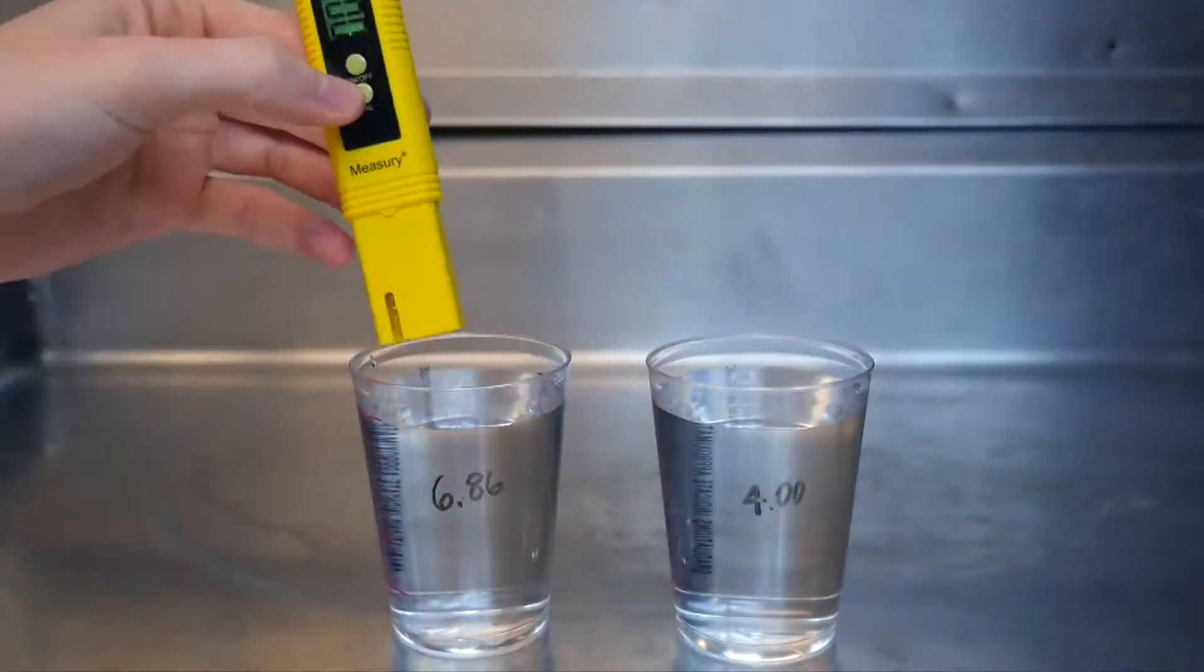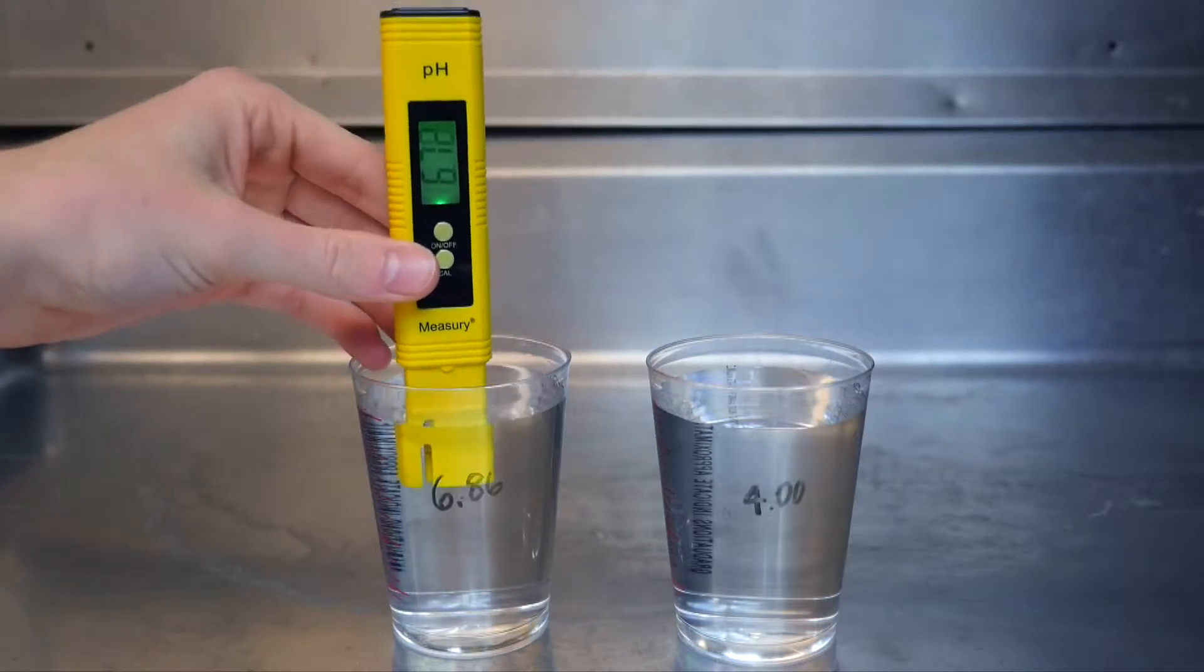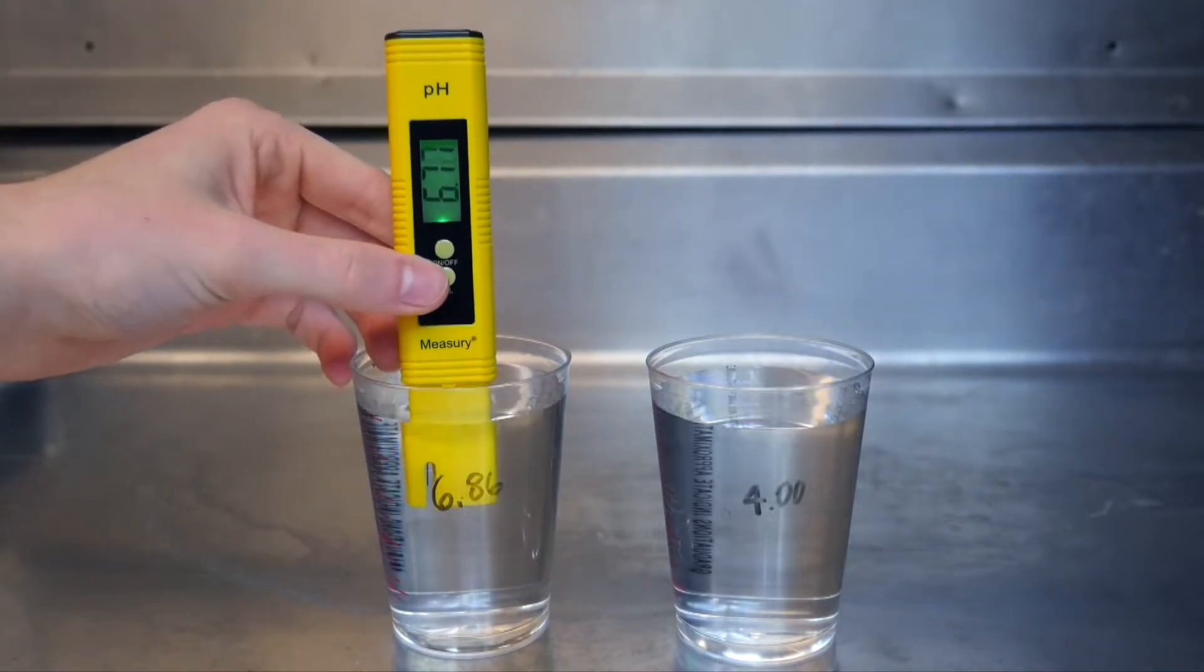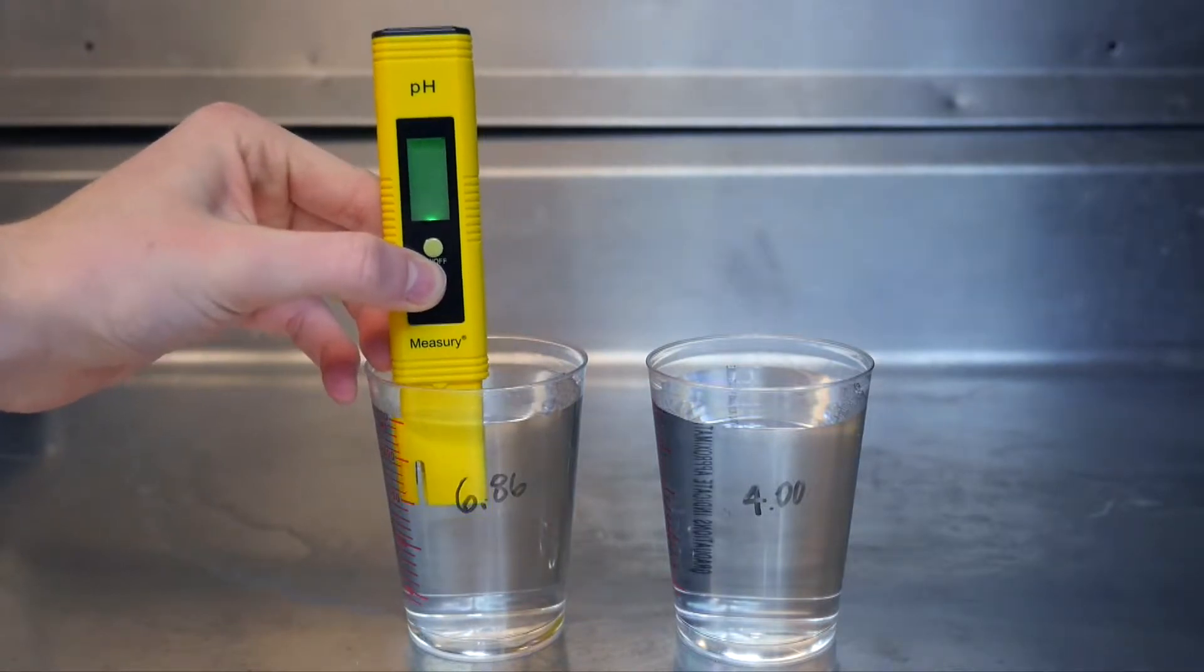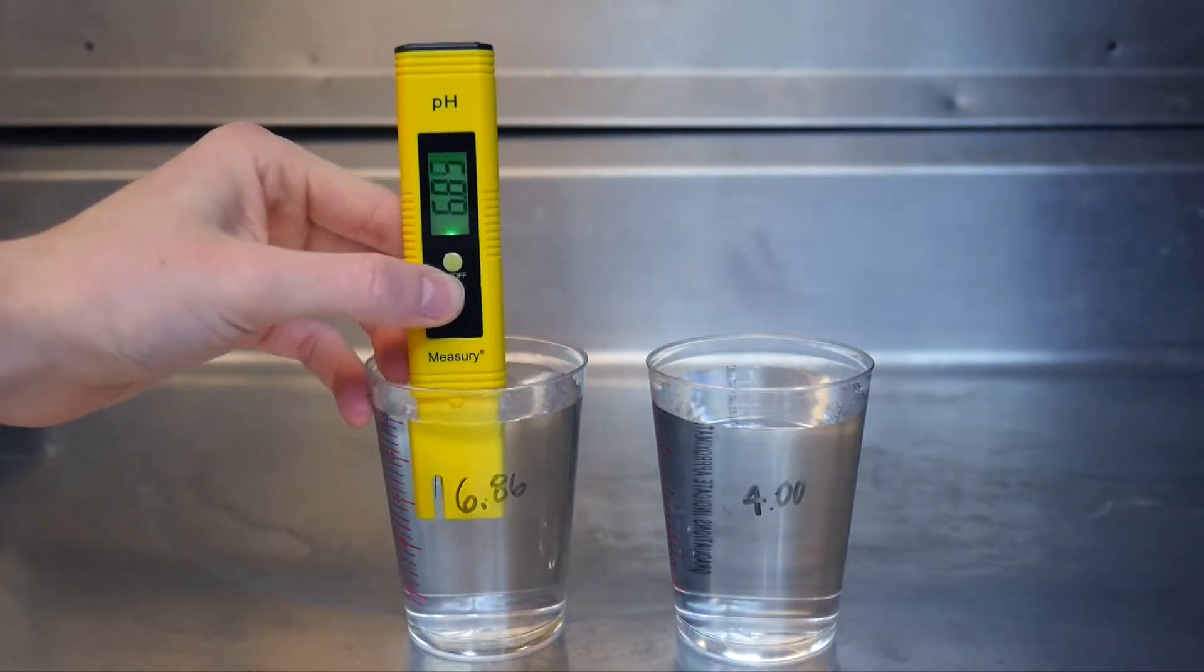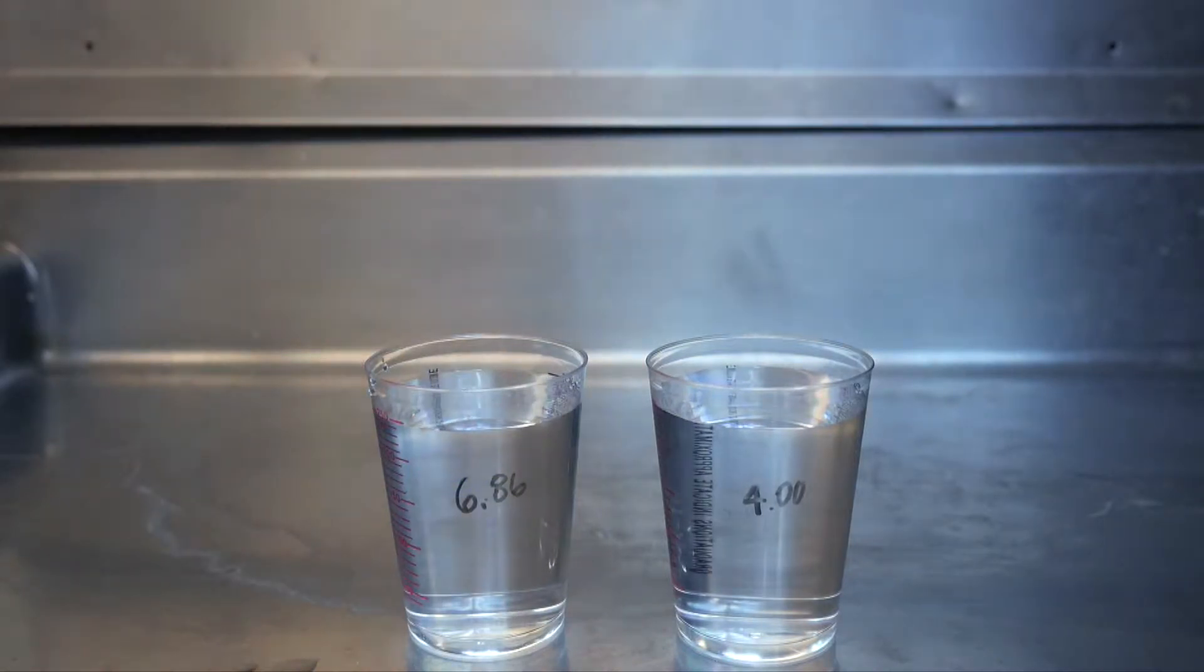Insert the meter's electrode into the 6.86 pH solution. Press and hold down the cal button for five seconds. After you release the button, 6.86 will flash on the display. Once it stops flashing, you can rinse the meter's electrode and move on to the next step.